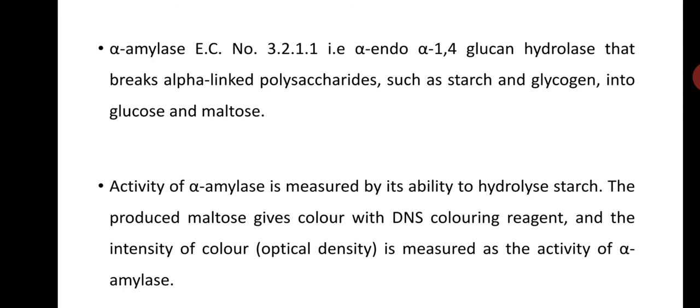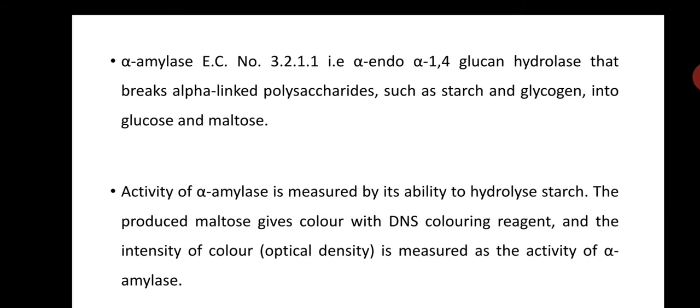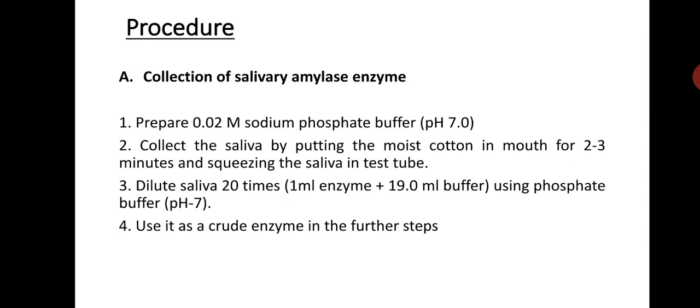So it means you are going to check the absorbance. The same thing which you have done earlier also. So this is the actual procedure. You are collecting your amylase. This is also written in your lab manual, right?